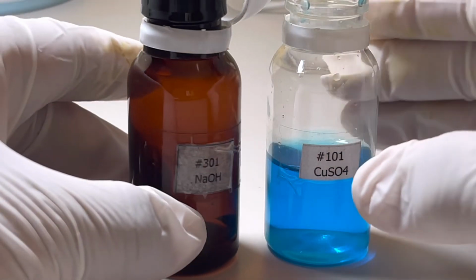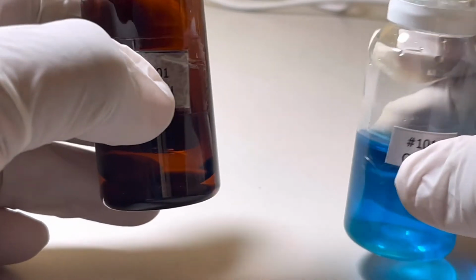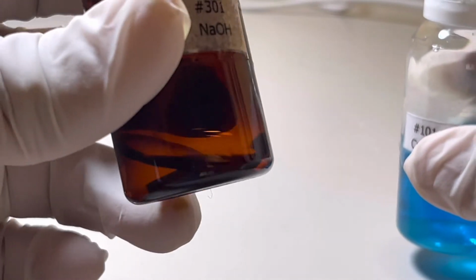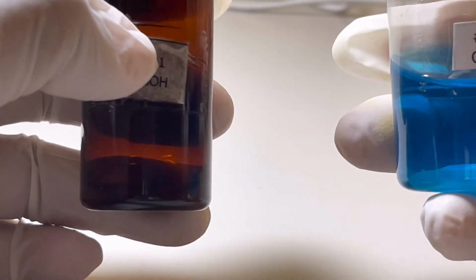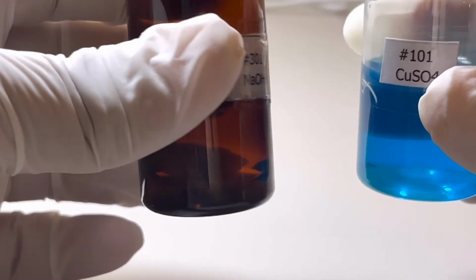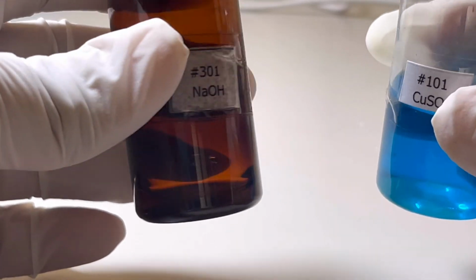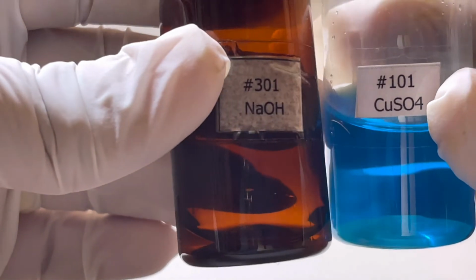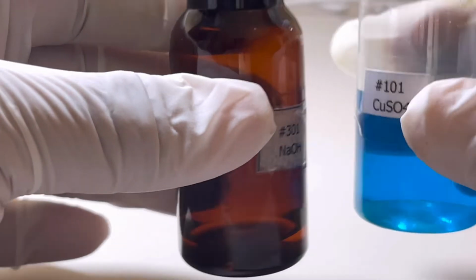Good morning, everyone. Today I want to do one experiment for you. I choose two solutions. One solution is sodium hydroxide and the second solution is copper sulfate. I want to combine them together and see what happens. Today I'm going to show you a precipitation reaction.